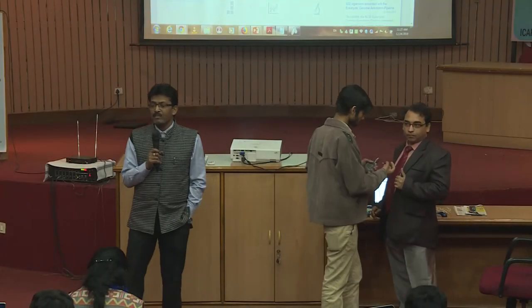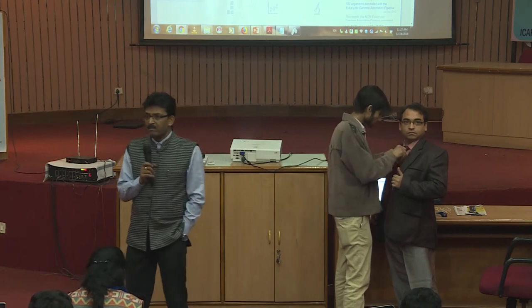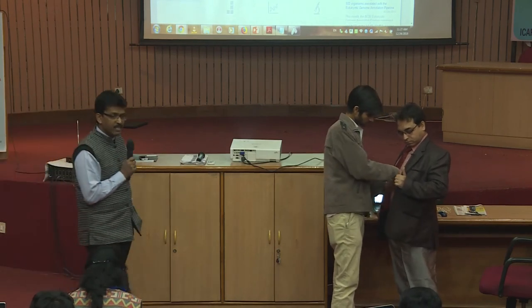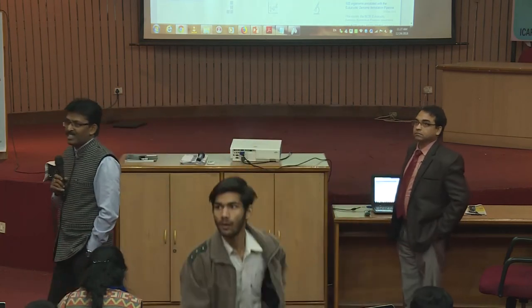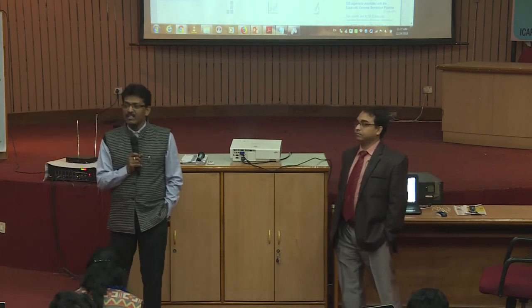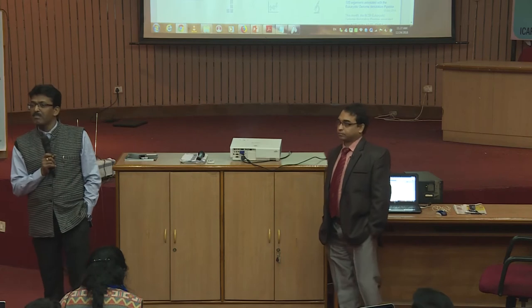So welcome back. We will start the second session this morning. That is all about multiple alignment and visualizing the multiple alignment files using different programs. Remember, CLC Genomics Workbench has a built-in option to create a tree from multiple alignment files. And we have a number of other programs also. They are freely available online. And one such program we highlighted last week is MEGA.